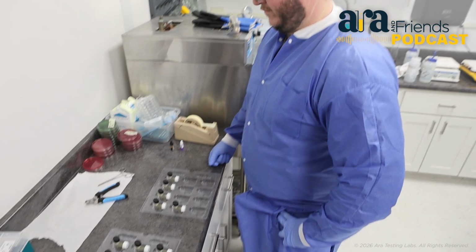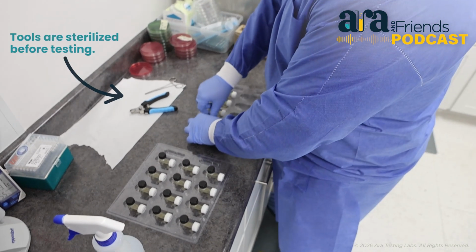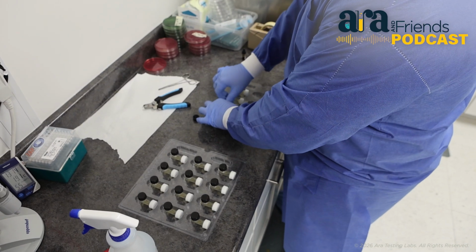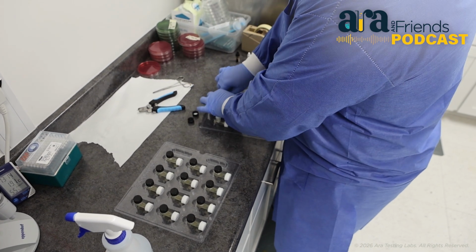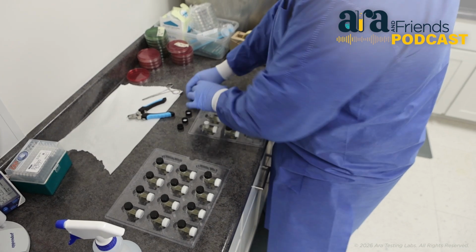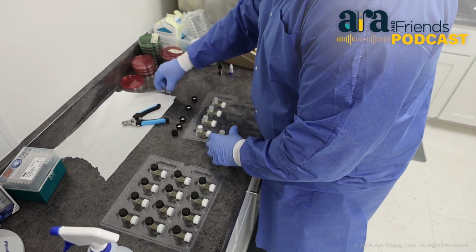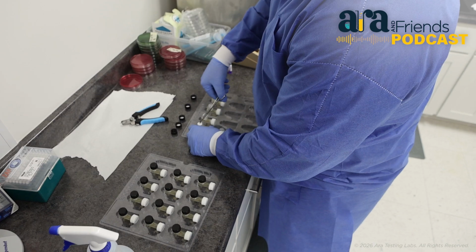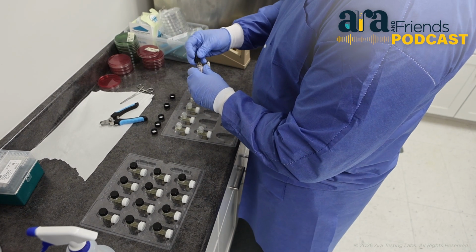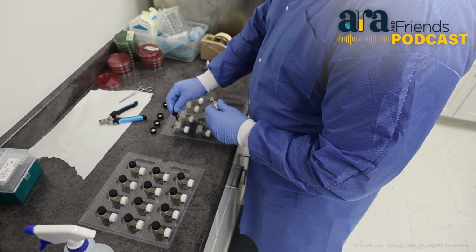All right. Okay, so this is the kit. Step 1, I'm going to take off all these black caps. First step, put your iodine in the black cap side.